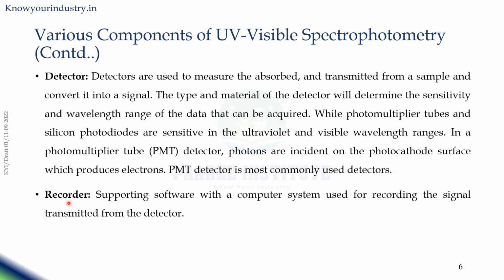Then another part is the recorder, which is generally used with the support of software on a computer system to record the signal transmitted from the detector, from which you can see the absorption readings, and these readings will be used for further calculations.